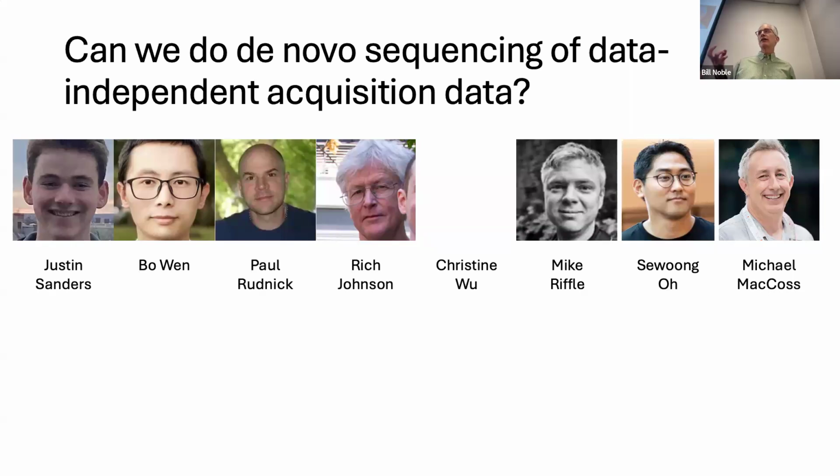And the basic idea of data-independent acquisition is that in a normal mass spec experiment, which people call DDA, data-dependent acquisition, you first analyze a set of intact peptides, and then you isolate particular peaks that correspond to some peptide species of interest, and you fragment that species in a sort of directed fashion, and then you get a signature that corresponds to that one peptide species. That was like the sample spectrum I talked you through earlier.